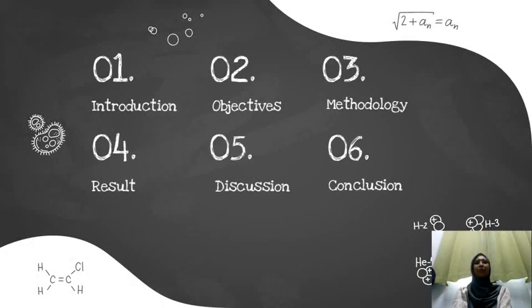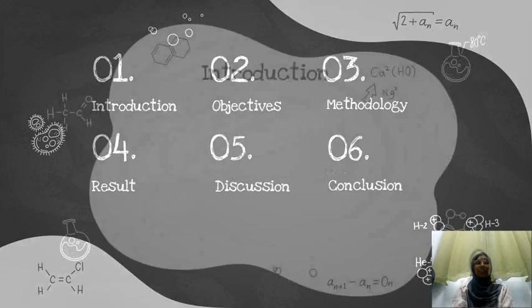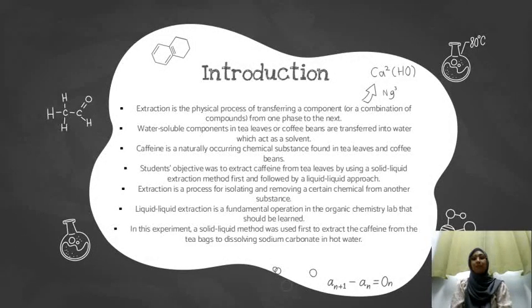In the video we have 6 parts: the first one is introduction, second objective, third methodology, fourth result, after that discussion, and the last one is conclusion. The first part is introduction.